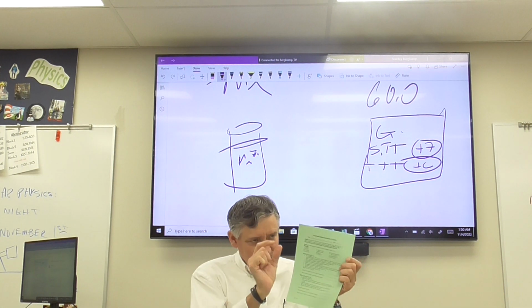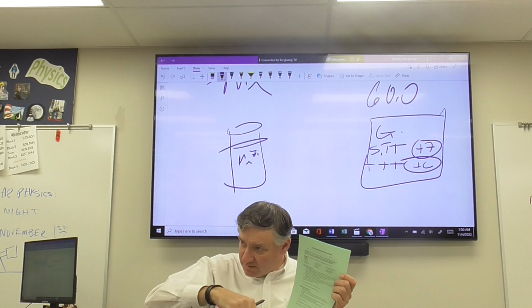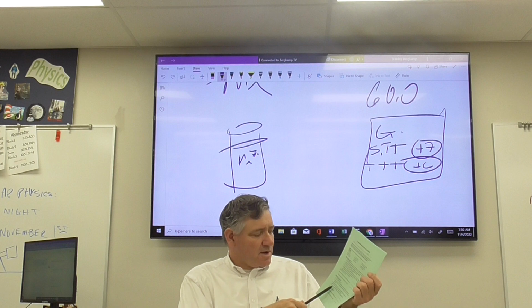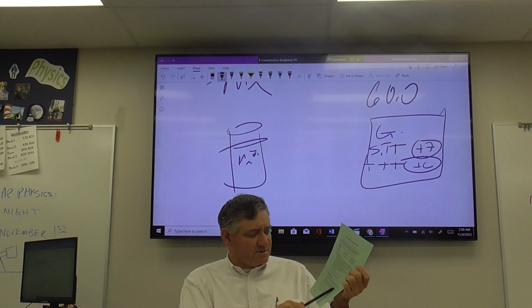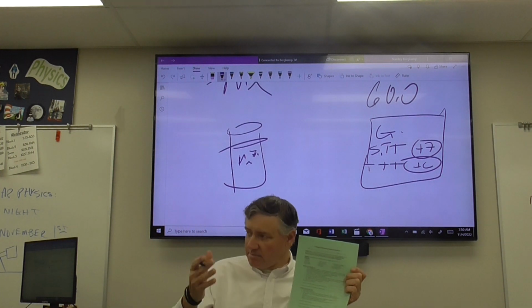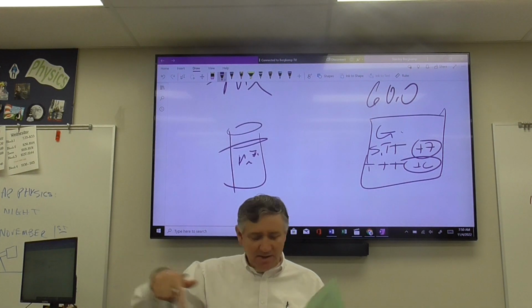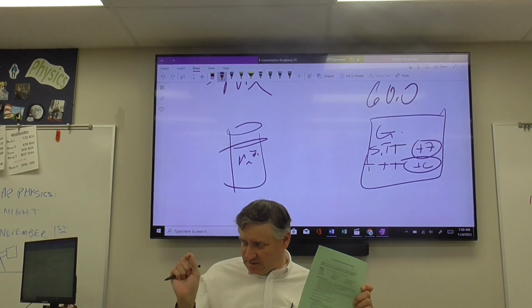So you're going to take your little graduated cylinder, measure out 3 milliliters of that, and put that into that tall test tube. Then you can take a 10 milliliter graduated cylinder, and you're going to add 1.2 milliliters of a 1 molar solution of sodium hydroxide to the test tube. The sodium hydroxide is going to be in a dropper bottle on your lab station. And again, you need to measure out 1.2 milliliters of this.